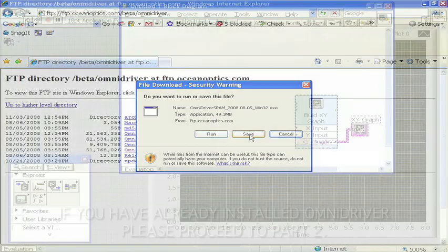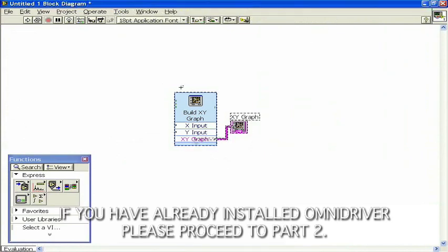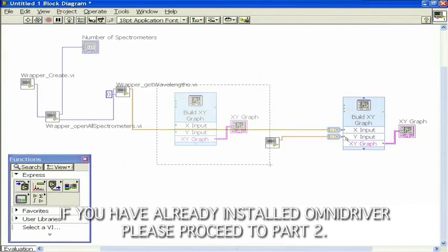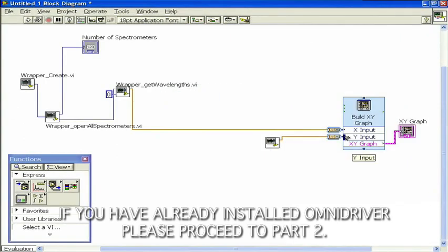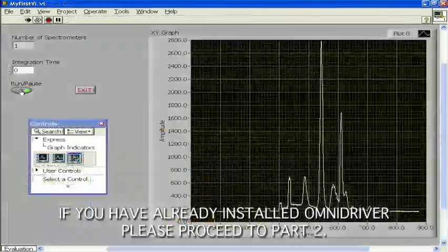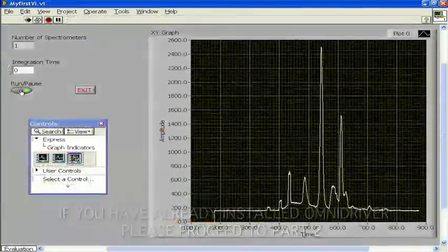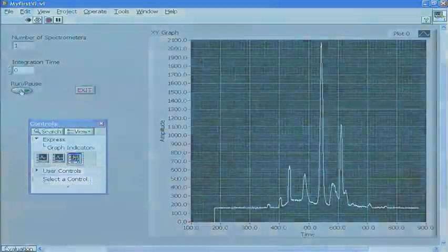In this tutorial, we will take you through the steps of downloading and installing the Omni Driver application, and we'll show you a simple example of displaying a Spectra in LabVIEW 8.6.